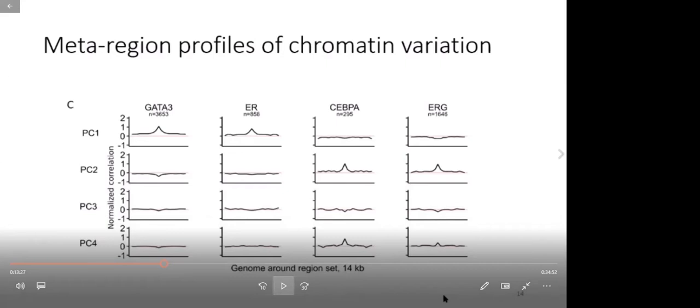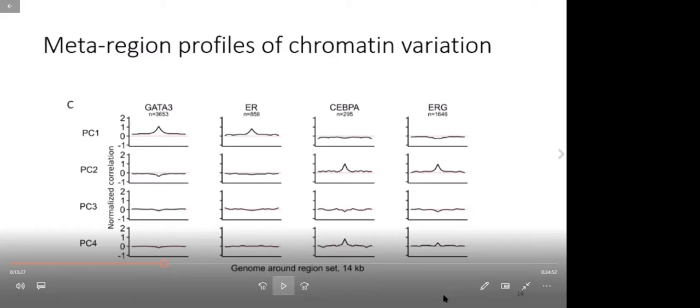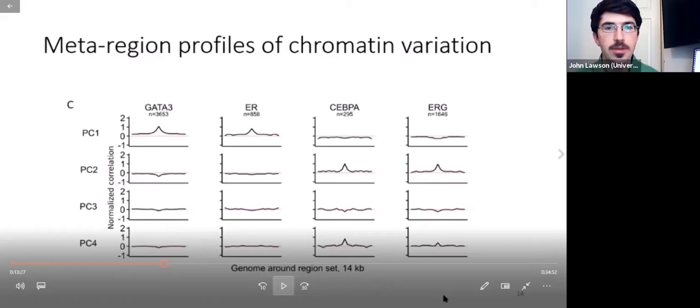So there's a question on how you're scoring the enrichment in the principal components, and then why you used only 73 breast cancer patients from TCGA, and what filter you used to reduce from more than 1,000 down to 73. Sure. So the first question, to get our region set score, it's very simple actually. We are essentially just taking the average of all the individual region scores that overlap with our region set of interest.